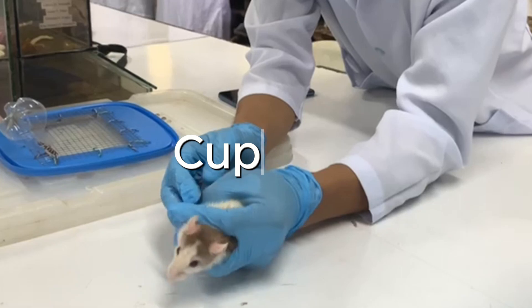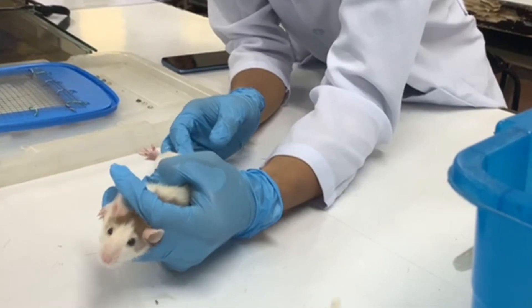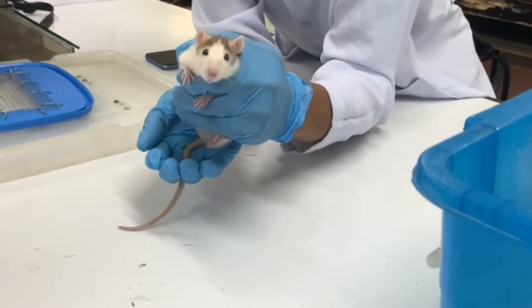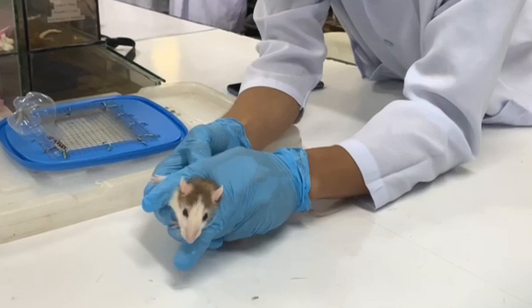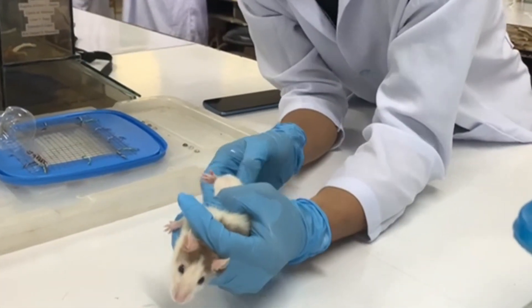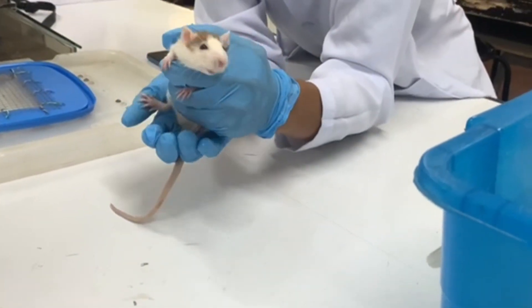The next technique is cupping. Scoop the mouse or a small group of mice onto the gloved hands, then loosely close the hands around the animals. This procedure is suitable for docile, well-habituated animals, and for experienced handlers with a confident approach. It is preferred for transferring mice over a longer distance.